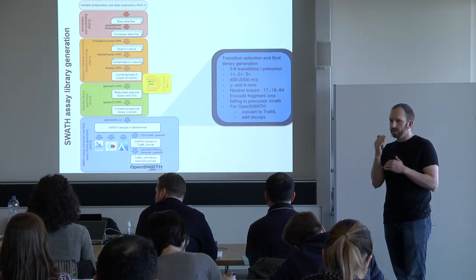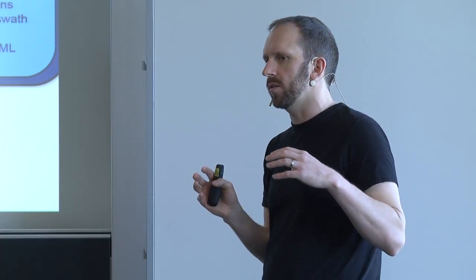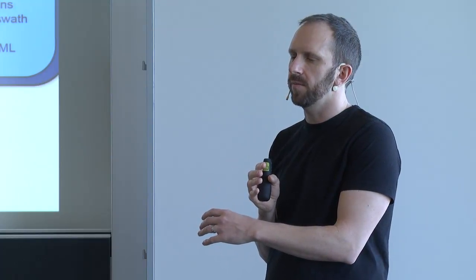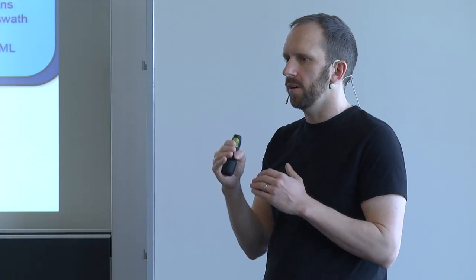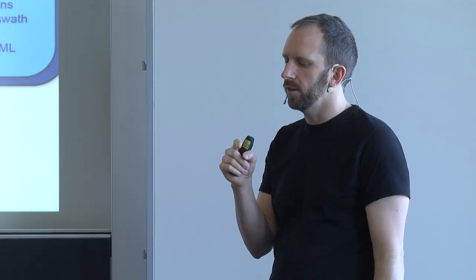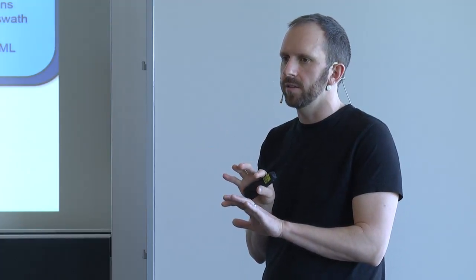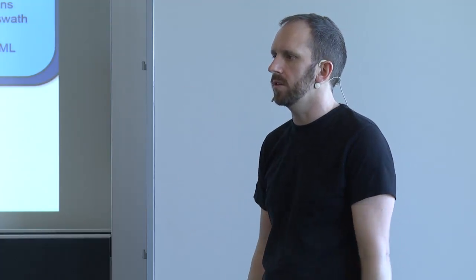Exactly, yeah. This window is going to be very noisy because in particular in a QTOF instrument, everything that goes into the collision cell doesn't necessarily get fragmented, which means there are many unfragmented precursors in this window. If you extract a transition from this range and plot it beside all the other transitions, typically you see it's very noisy, so we usually kick it out.